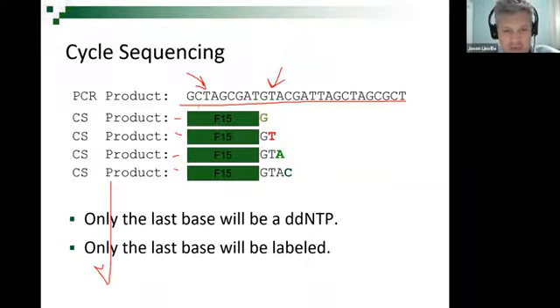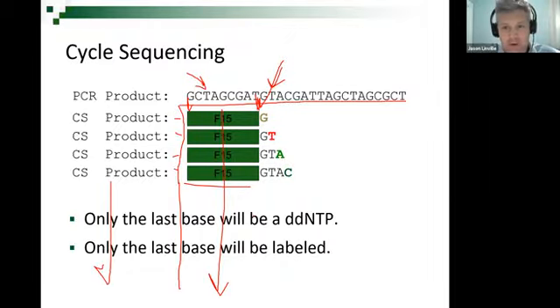So when you cool it down, 1 million primers attach to 1 million copies of DNA. Okay. And then you heat it up a little bit more to 72, 1 million polymerases attached to these 1 million copies of amplified DNA with the F15 attached. The F15 sort of attaches right here. All right. And then the polymerases, all 1 million of them, start adding letters.